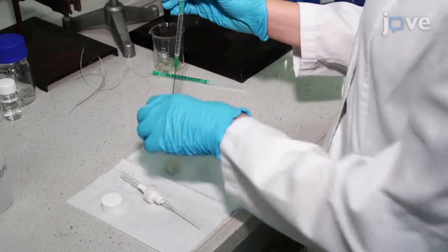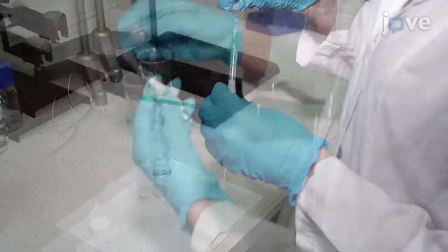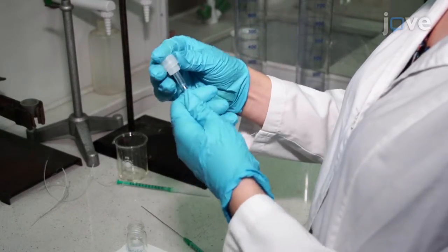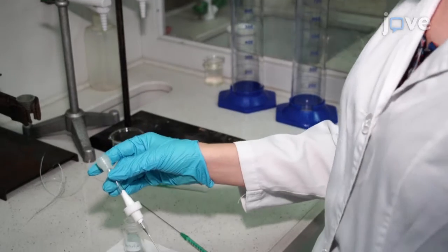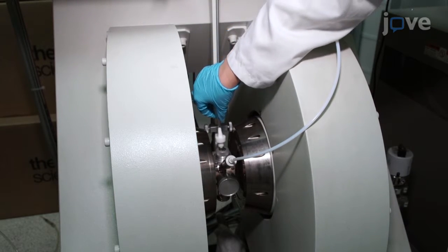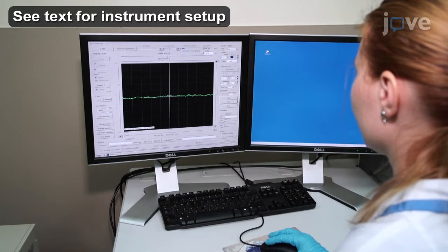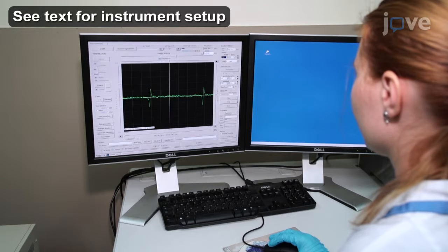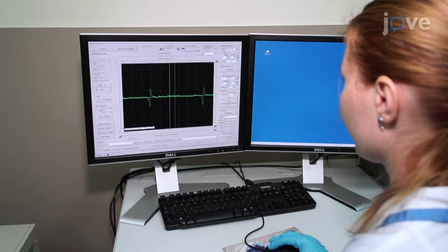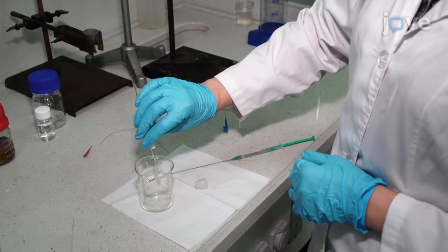To begin the EPR spectroelectrochemistry procedure for polymeric materials deposited on a working electrode, fill the spectroelectrochemical cell with the electrolyte and place it in the EPR spectrometer. Set up the manganese standard and adjust the instrument parameters to cover only the third and fourth manganese lines. Acquire a background spectrum, check for contaminants, and then remove and clean the cell.